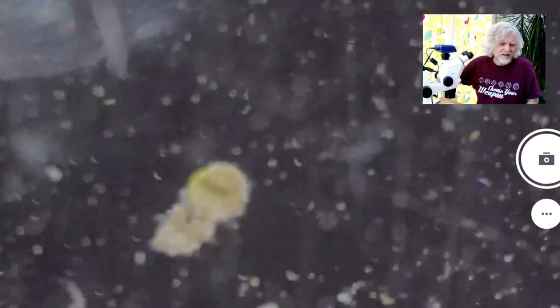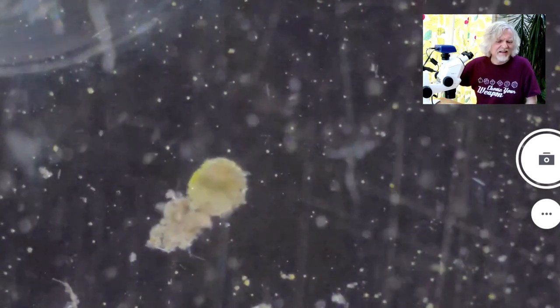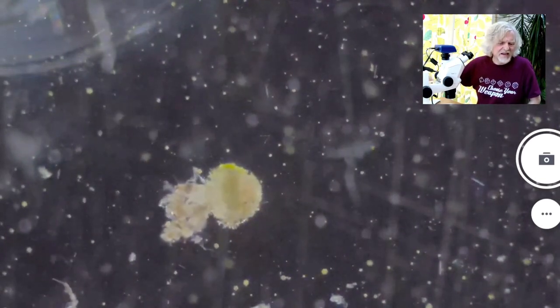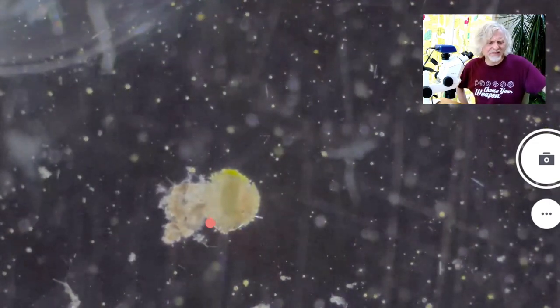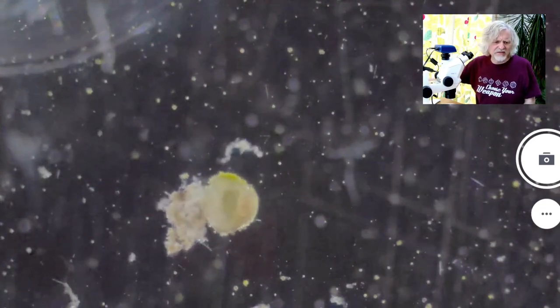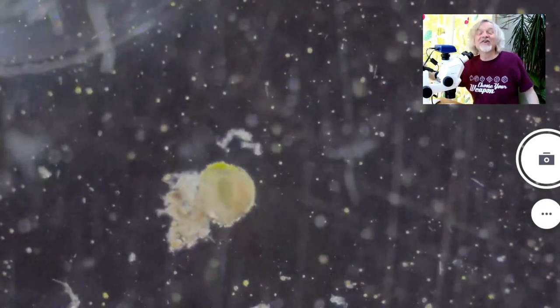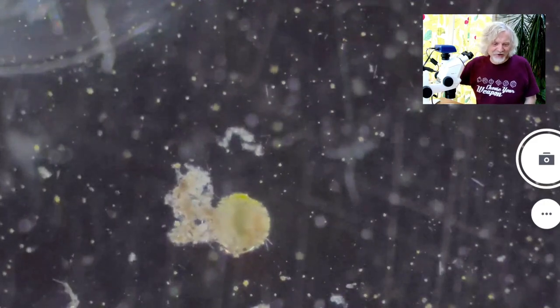I'm going to zoom in on this one here. Focus, focus, focus. Let's find a better one to focus on. What I want is one that's not moving, that's sort of having its dinner. And there you can see it's got this little bit of, don't know what it is, bit of detritus, bit of plant material. And it's just nibbling away on it. Oh, it's had a little poo. There you go. It's not often you see an ostracod pooing live on on your Internet.